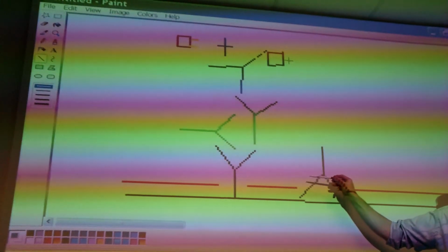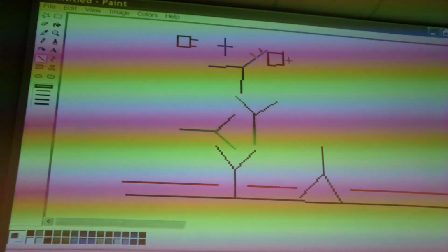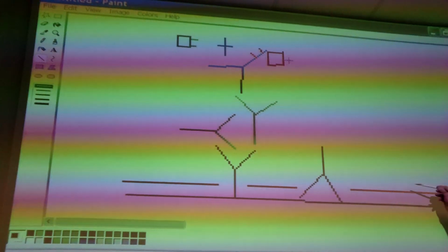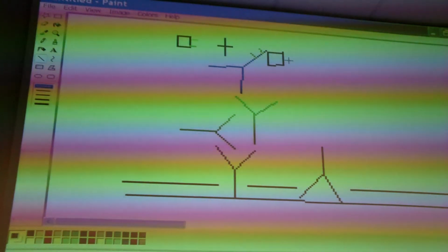Another blocking. Just use a control. You can correct for it, just not including sample and measure it. Okay. Use monoclonal antibodies, not polyclonal.